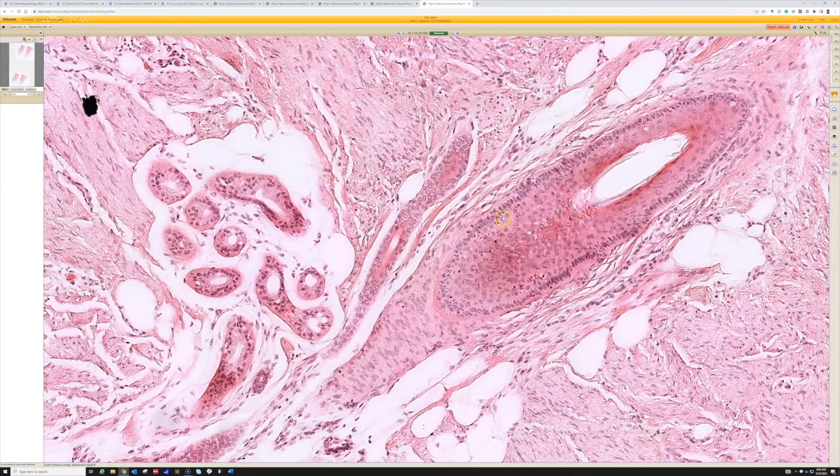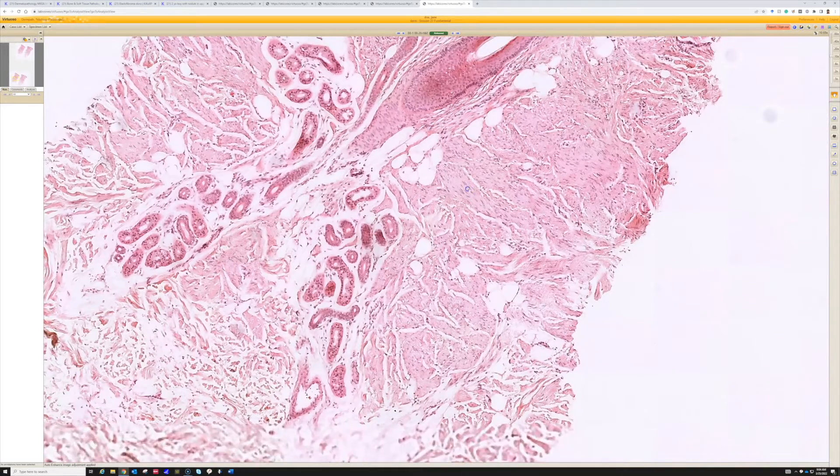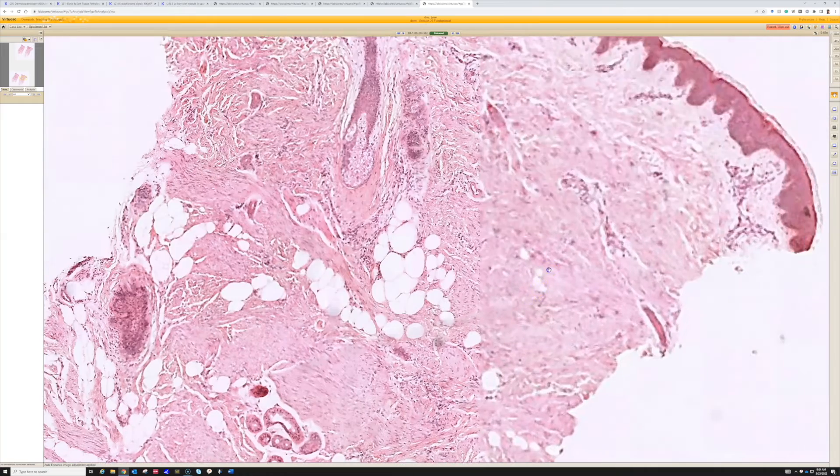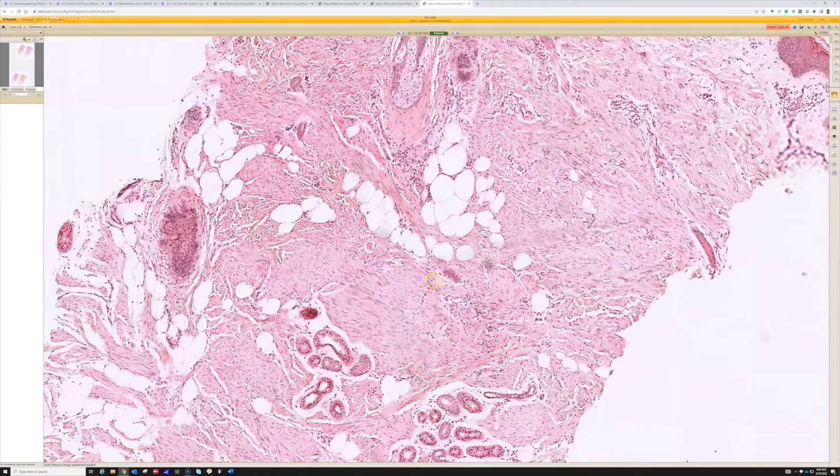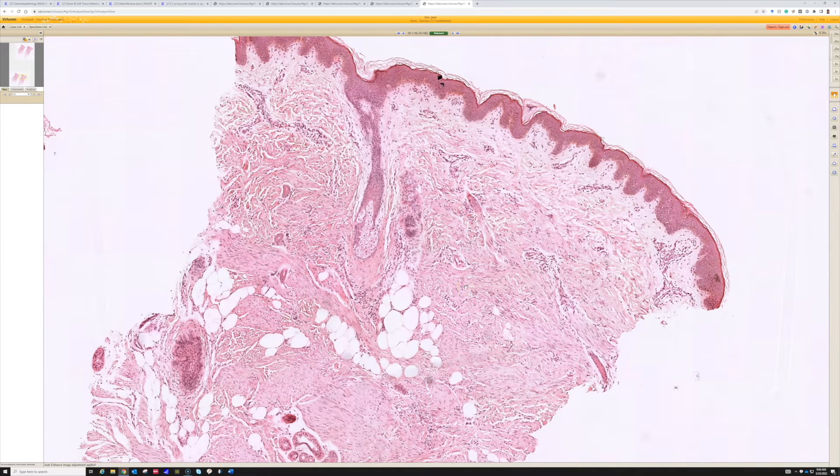They are leaving the adnexal structures totally intact. They're kind of just going in between them, but they're not replacing the adnexa, which is kind of interesting. And so the parallel fascicles of bland spindle cells in pink bundles, that is what we call a dermatomyofibroma.